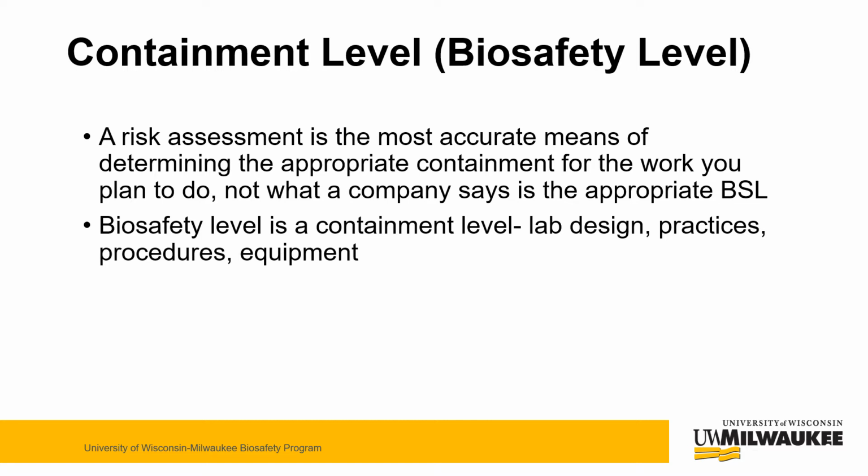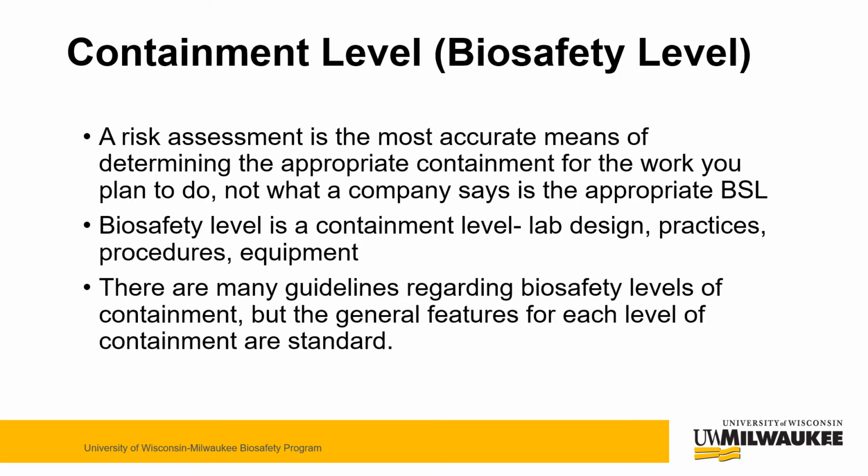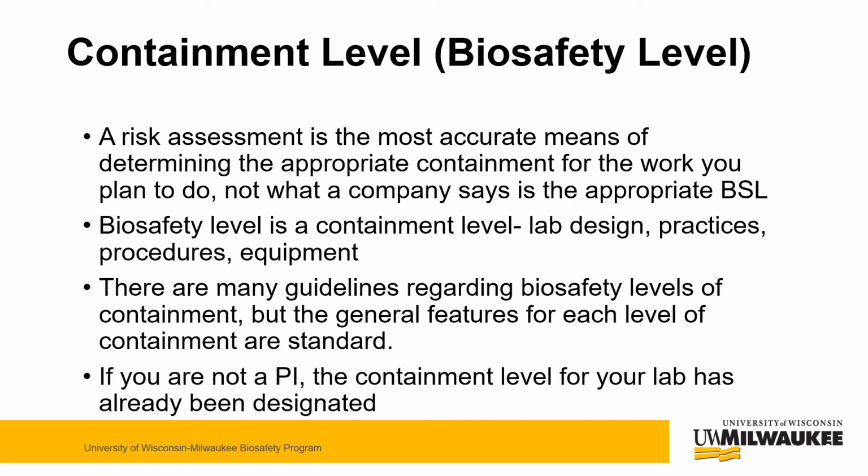Remember, the biosafety level is a containment level, and it integrates lab design, practices, procedures, and equipment. There are many guidelines regarding biosafety levels of containment, but the general features for each level of containment are standard. If you're not already a principal investigator, then the containment level for your lab has already been designated.